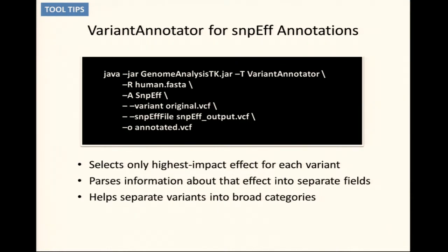In this long string that snpEff provides of potential protein changes for all of the transcripts that a particular variant overlaps, it determines which is the worst one. If I'm interested in excluding synonymous variants, and the worst possible effect is synonymous, then no matter what, I don't want to consider this variant. However, if that's not what you want, there's always the original file to go back to get all of the information.